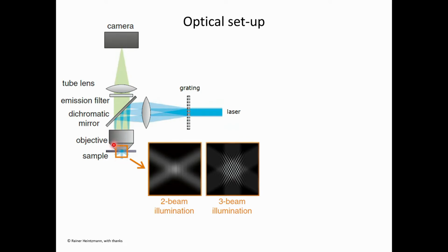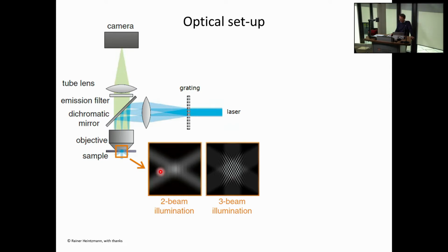Essentially, what I'm creating is a plane wave going at k minus 1, and at k plus 1, and at k naught. And if I have all three beams present, 1, 2, 3, then I get this light lattice. So you can see the original light this way, and that way. So you get crossing illumination. One goes that way, one that way, one that way, and that gives you this lattice. If you have only two components, k minus 1 and k plus 1, you see that the fringe pattern really is only in the vertical direction, as I've shown you on the overheads.